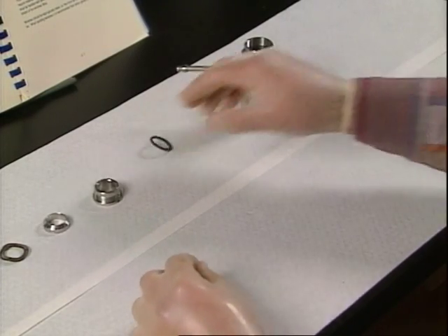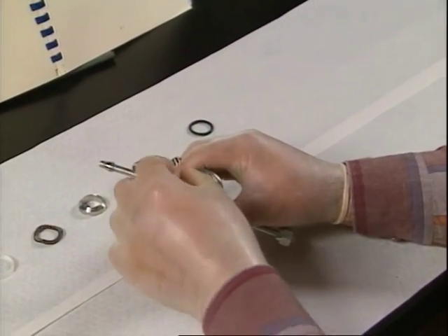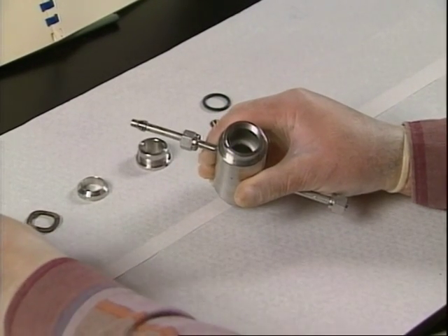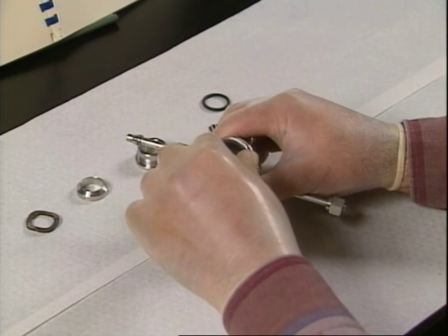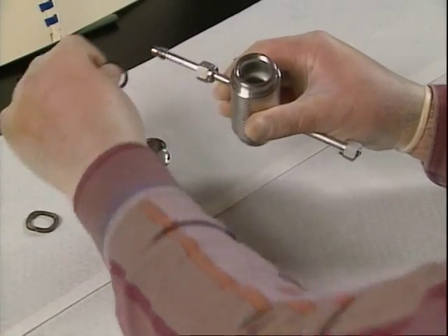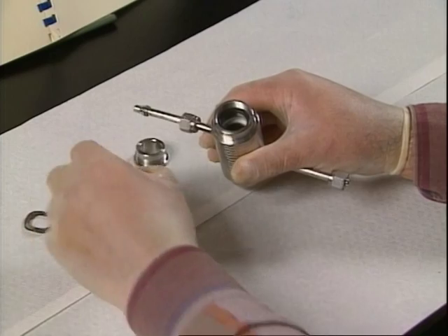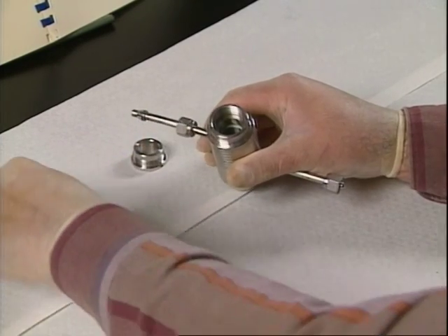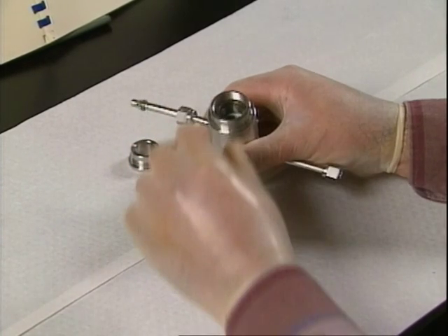Thin cotton or rubber gloves should be used to prevent contamination of components and to provide dexterity for handling small parts. Insert new gaskets and carefully replace the windows. Install new O-rings and other sealing kit items. Ensure that all pieces are free of dust, hairs, or particles that may adversely affect the analyzer. At this point, you should also recheck the windows to ensure that they are free of solvents, residues, and fingerprints.